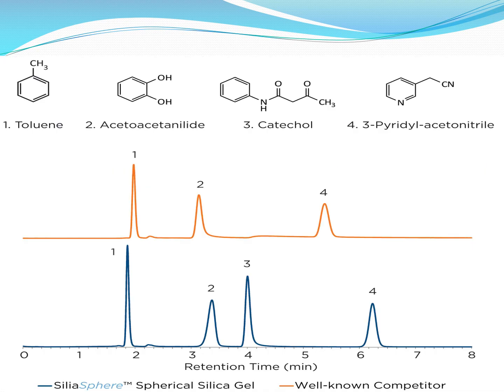Now, we should know a very important thing. Before we inject the sample, we should have some idea about the components of this sample. And we should have a control or a calibrating sample with us to know the TR or the retention time and the amplitude of each material. And by comparing the control sample to the graph that we have from our sample, we can know the components and we can know the amount of each component. The amount of each component corresponds to the height or the magnitude of the signal that results from this sample, as we can see here. And this time represents the kind of the sample or the component separated, the type, if you can say that.